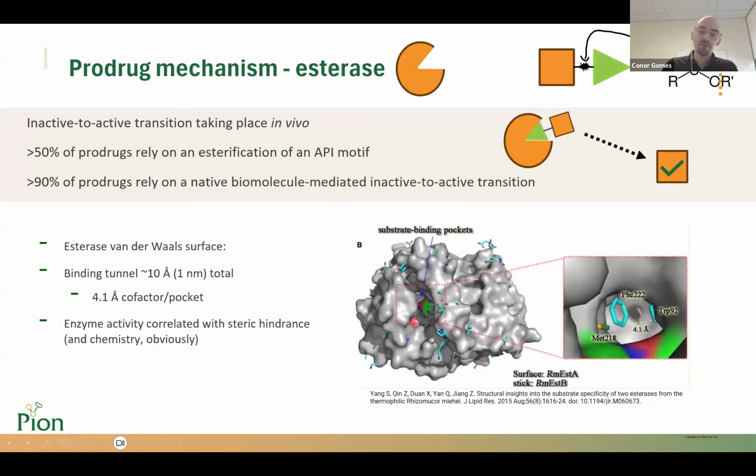What this means is that within the SCISSOR platform, or any dissolution apparatus where you are probing the action of prodrugs, or the uptake of a prodrug, or the cleavage of a promoiety from a prodrug, you're going to have the enzyme of action within that assay. I give an example of esterase on the screen here. Esterase is the most common enzyme for all of the prodrugs that have been cleared by the FDA to act on. I believe it's over half of them.